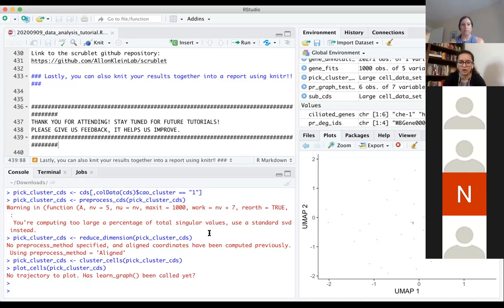First question is, what's the number of your recovered nuclei or cells? From the data set I was using, I think it was maybe 30,000. Okay, so is it a combined CDS or one single CDS? One single one. Okay, and you've done all the filtering and the basic steps in the beginning? The basic steps, at least, like processing and reducing dimensions and all that. Yeah. Okay, so one thing before you proceed would be to check for doublets. Just make sure that you're not working with any doublets.